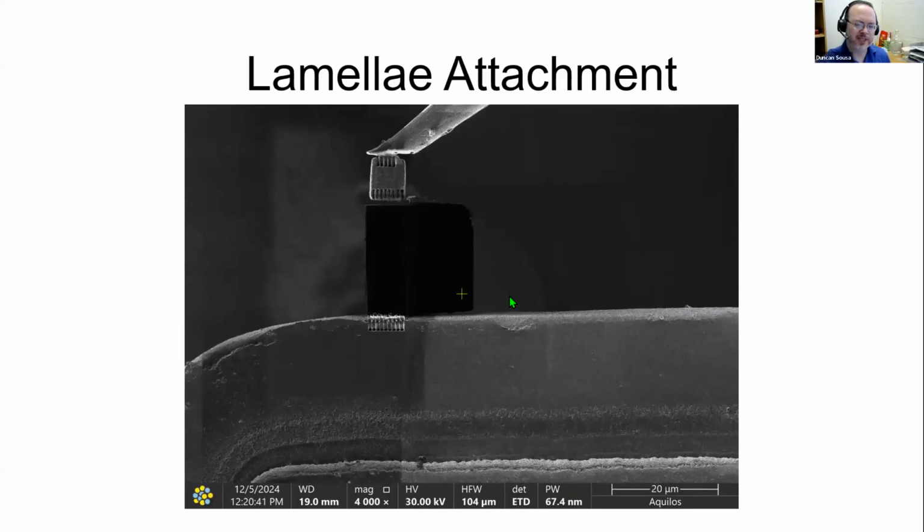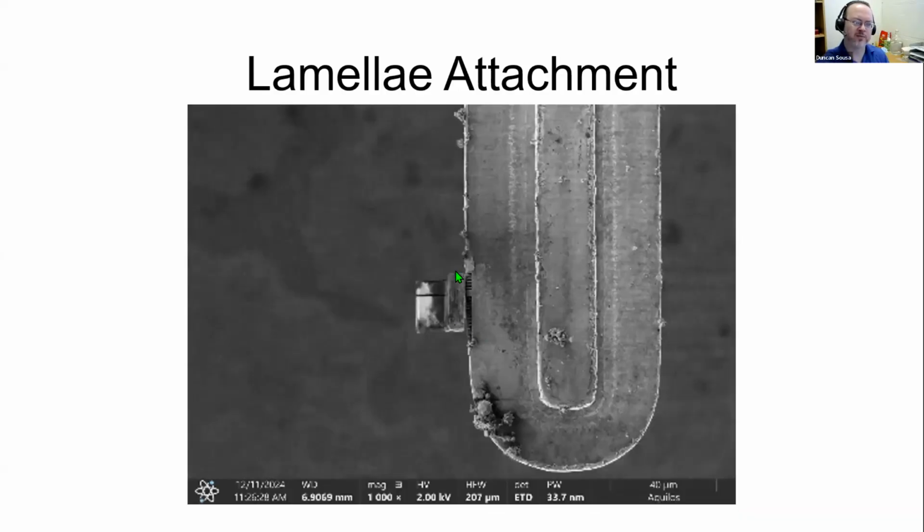The next part is we need to attach it to the finger or grid of your choice. One obvious way to do it that we first tried is just attaching the bulk portion to the side. But really what I want to do so I can get a nice tomogram is attach it in this manner so that you can get a full range of tilt. And it is nicely orthogonal to the direction of the beam. So you don't have the problem of missing some angular flexibility in the microscope once you get to the Krios.